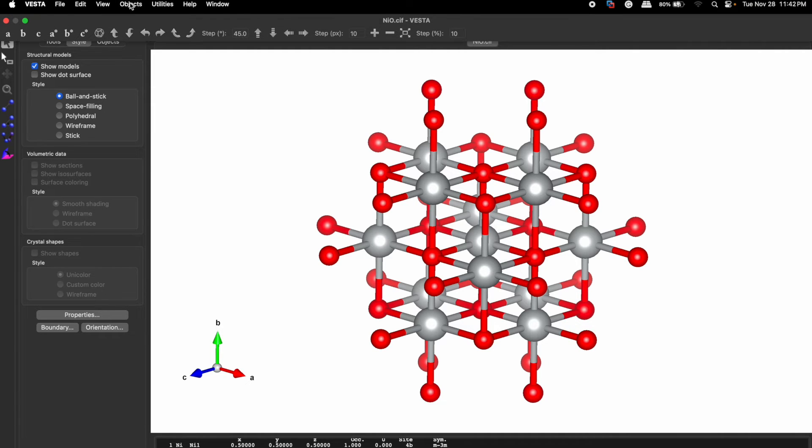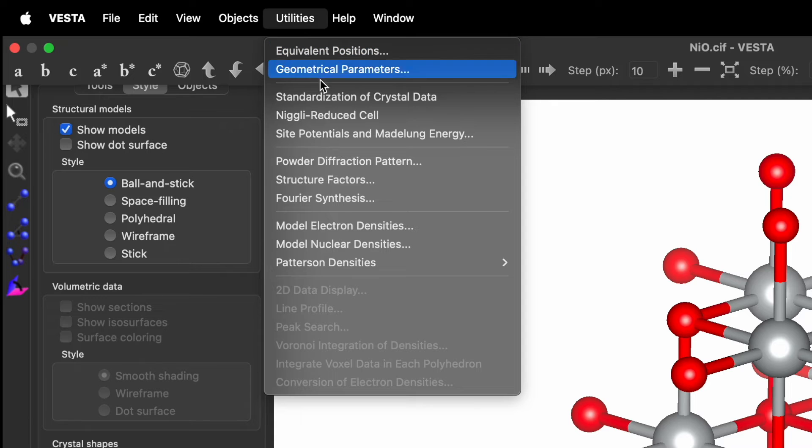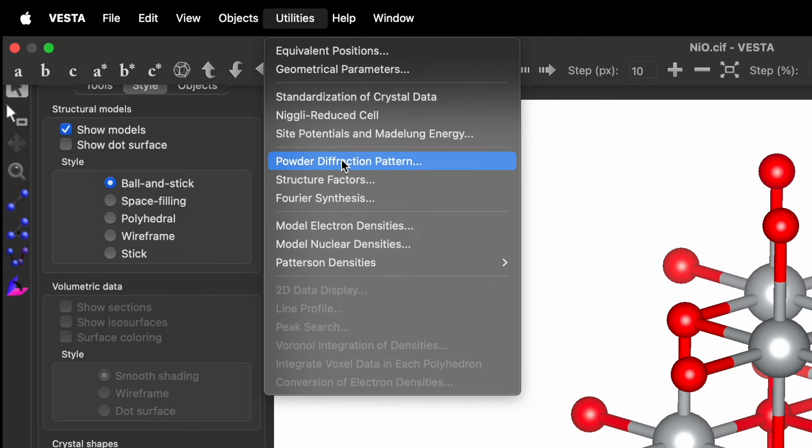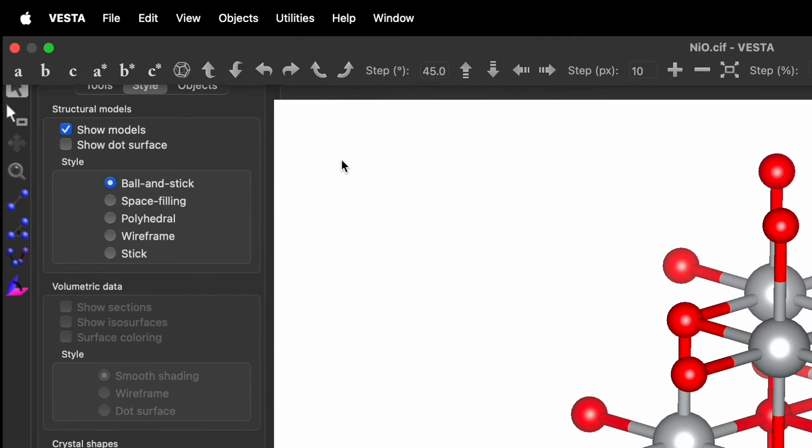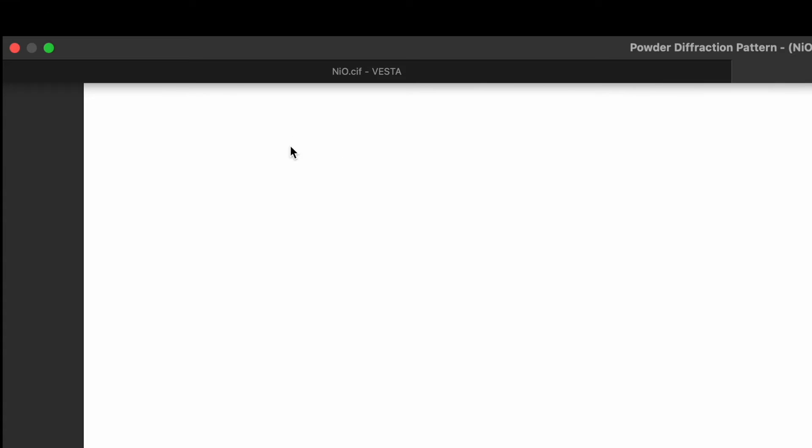Go to utility and then we will find option for powder diffraction pattern. So click over here. A new window will pop up.